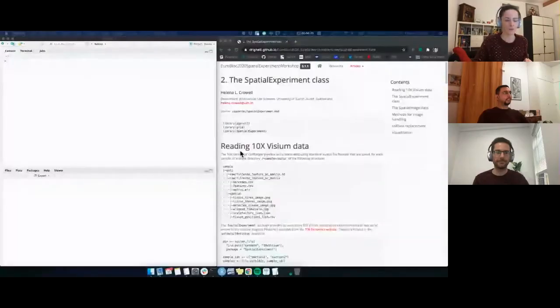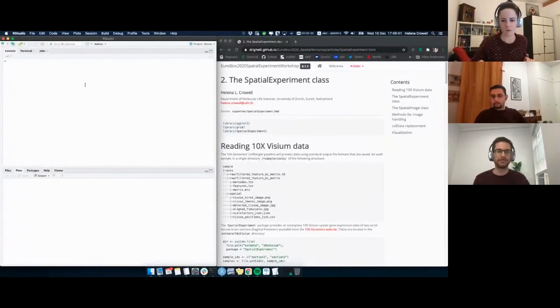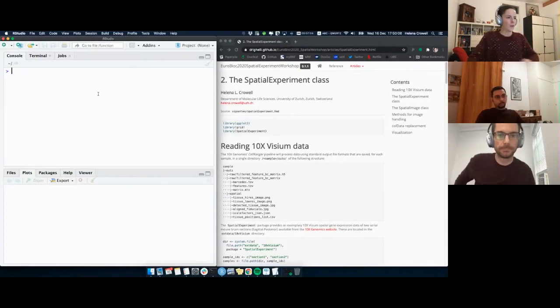So I hope those who are interested in typing along have their session open. Can you see my RStudio? Okay, good. I'm keeping also this open for my own reference.